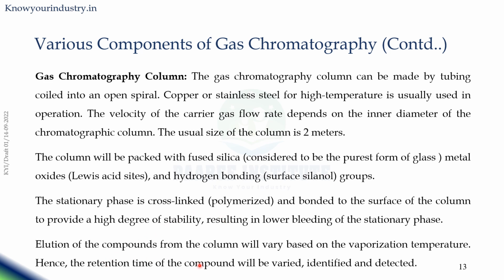Then finally, the elution of the compounds from the column will vary based on the vaporization temperature. So the retention time of the compound will vary, and the compound is identified and detected through the detector.